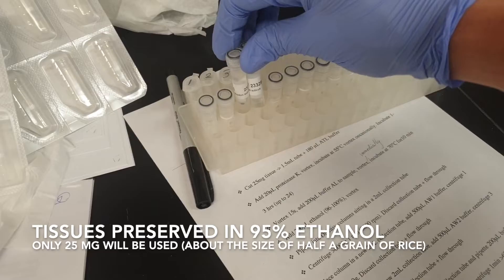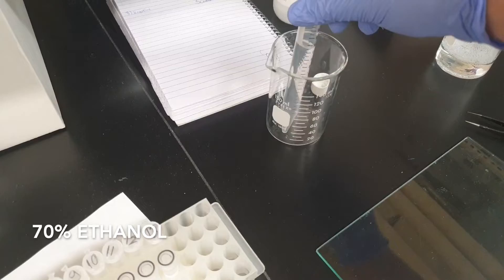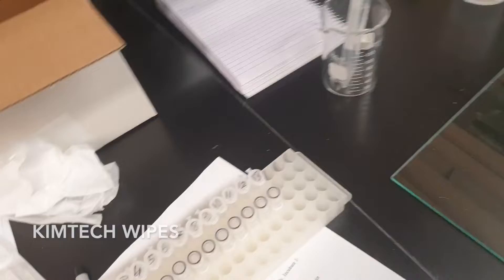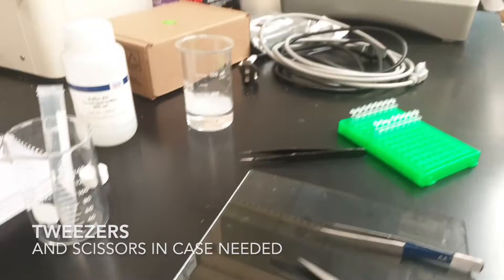We have our tissues here; we're only going to need about 25 milligrams of tissue. We have sterile 1.5 milliliter tubes, 70% ethanol, micro-cleaning solution, and Kimtech wipes. We also have PCR tubes filled with sterile water, tweezers, and scissors in case we need them.